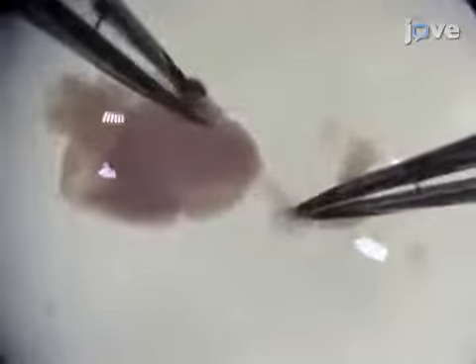Next, remove the hindbrain, brainstem, and both maxillae with the adhered palatal shelves. Cut the anterior upper jaw tissue, keeping both the primary and secondary palates intact.